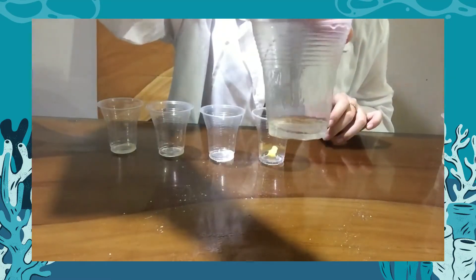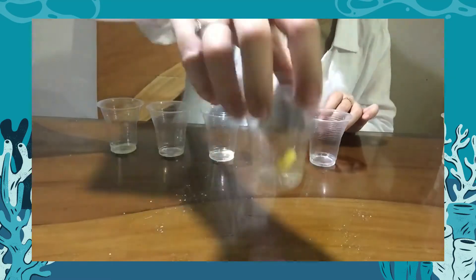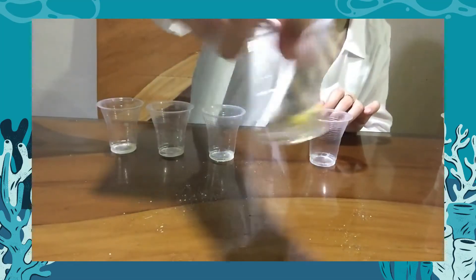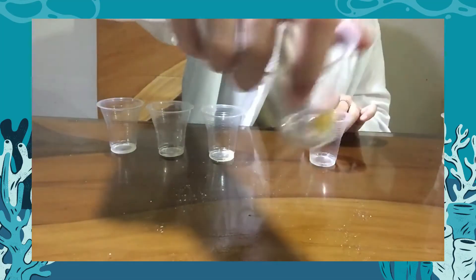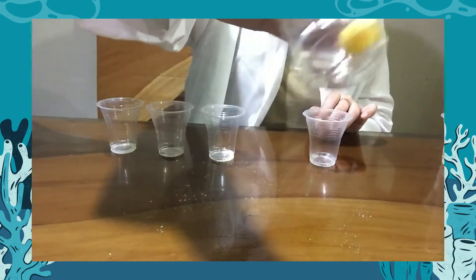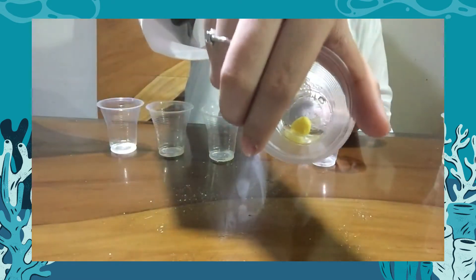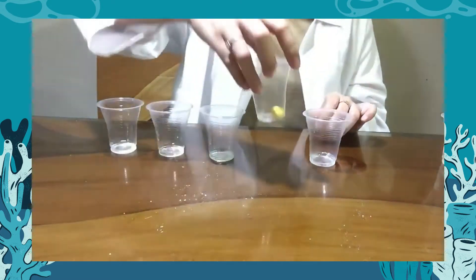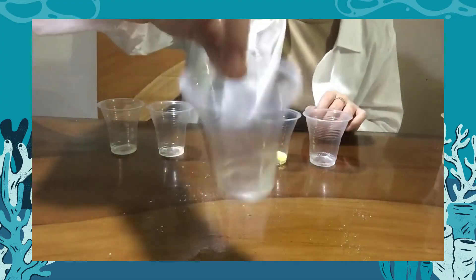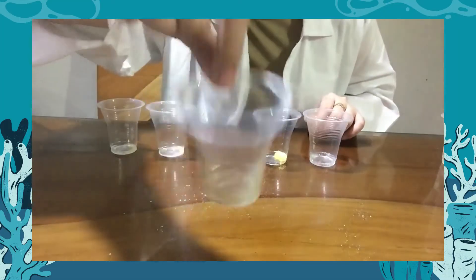The mixture of ethanol and water formed a homogeneous mixture. The next one is margarine with water. As we can already see, the margarine could not be dissolved with 1 ml of water — it remained solid and intact. The next one is water with sodium chloride.